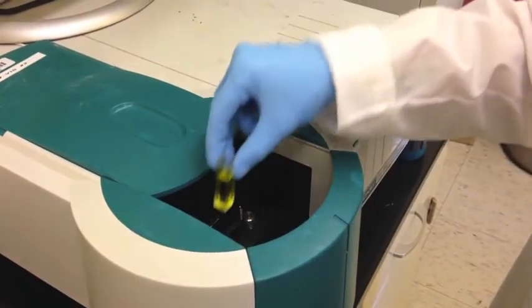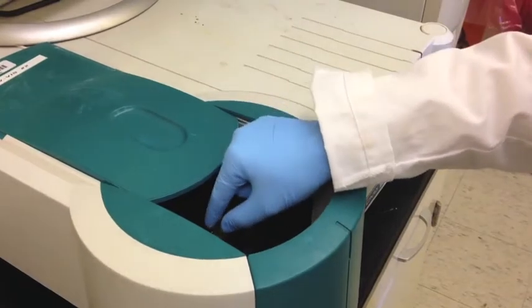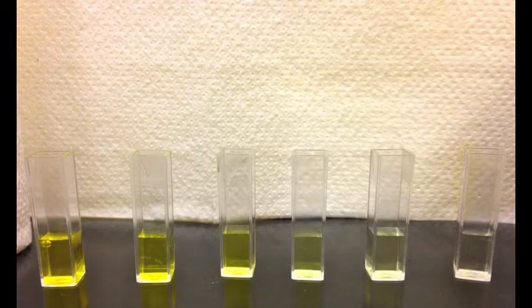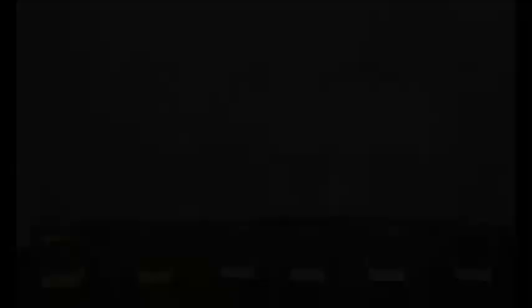When placing the cuvette in the spectrophotometer, make sure the proper side of the cuvette is facing the sensor. The calibration curve gave us a relationship between the absorbance measured and the concentration of tartrazine. This curve will later be used to determine the concentration of tartrazine in our sample over the course of the experiment.